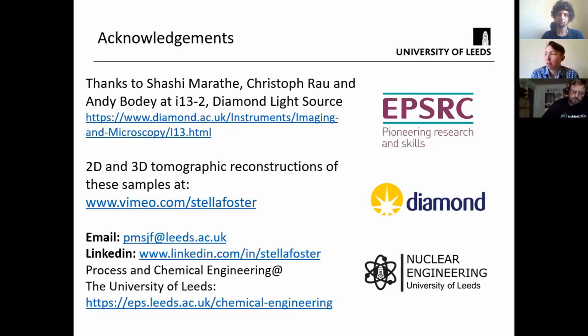The purpose was, these samples were part of a wider project which was initially attempting to functionalize biochar with zinc sulfide nanoparticles. And it's for that reason that I chose a low temperature pyrolysis.